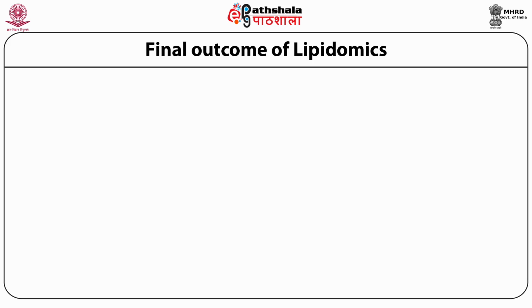Here you see a flow chart that depicts the final outcome that you would get if you're performing a lipidomics study. You can apply all the techniques that we have studied so far, like GLC and HPLC, separate the lipids, and analyze them through mass spectrometric techniques.